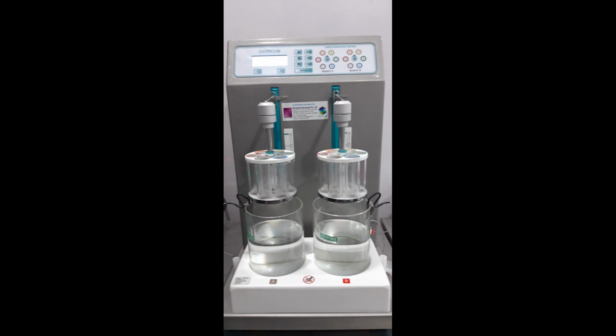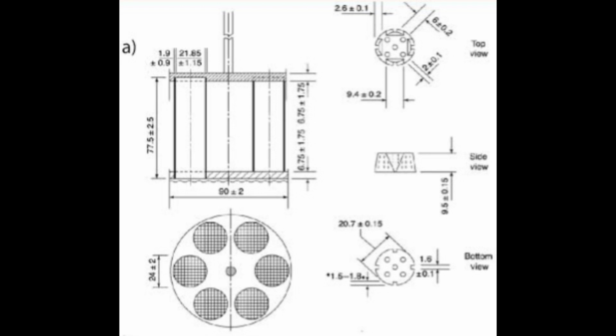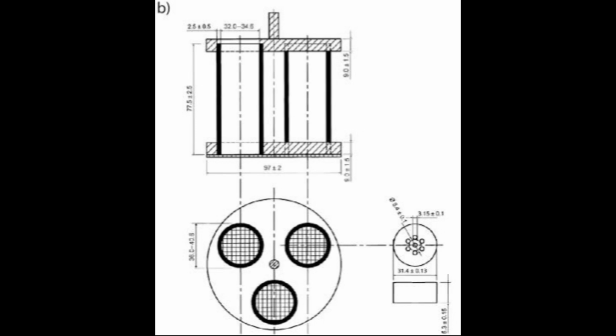Single tube and multicell variants to accommodate large tablets or suppositories: Type A, 6 tubes, and Type B, 3 tubes of larger diameter, racks emerged. Integrated data logging: modern instruments log temperature, stroke count, and time to disintegrate, and interface with LIMS.